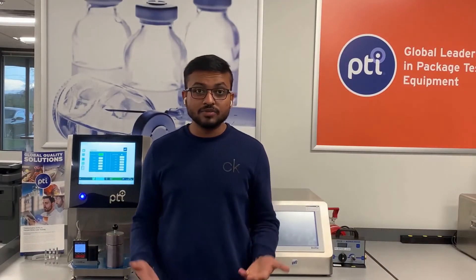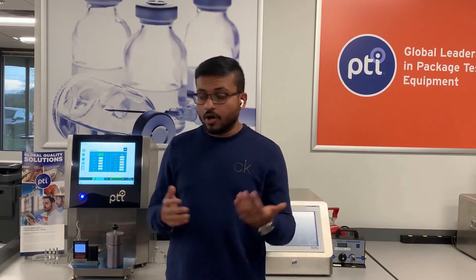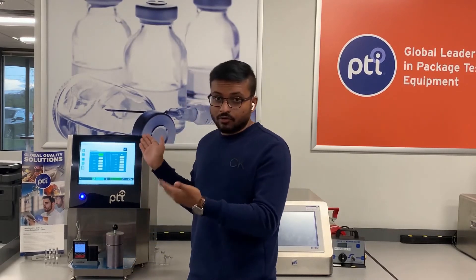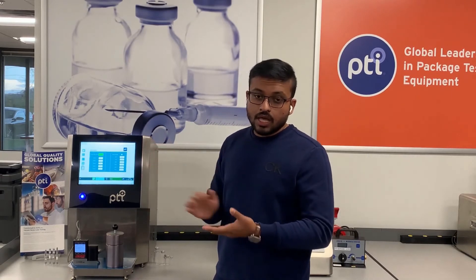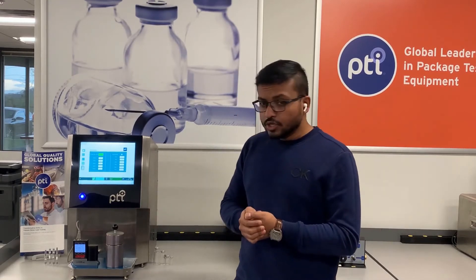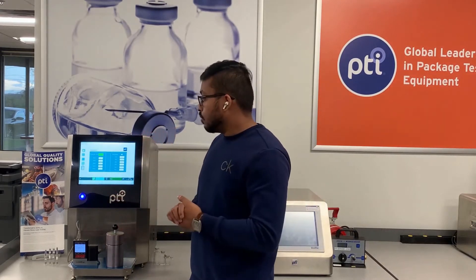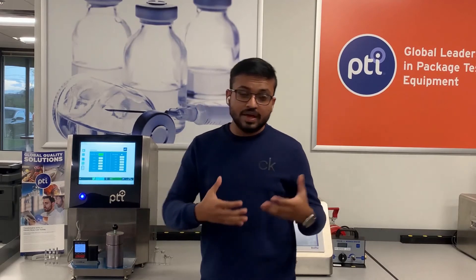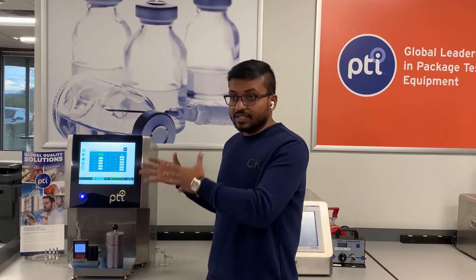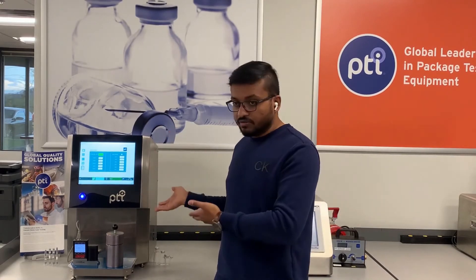I'm Sandeepan Sahab, an electrical engineer with PTI. As Nobi described about our new latest and greatest Varapak 465 vacuum decay machine, I'll be walking you through some of the cool features that we have added on this machine. As you can see, it has a 12-inch capacitive touchscreen. This is a full-fledged HMI PC, and the Ethos integration will be done in the 465 itself, so we wouldn't be needing any extra PC connected to the machine.